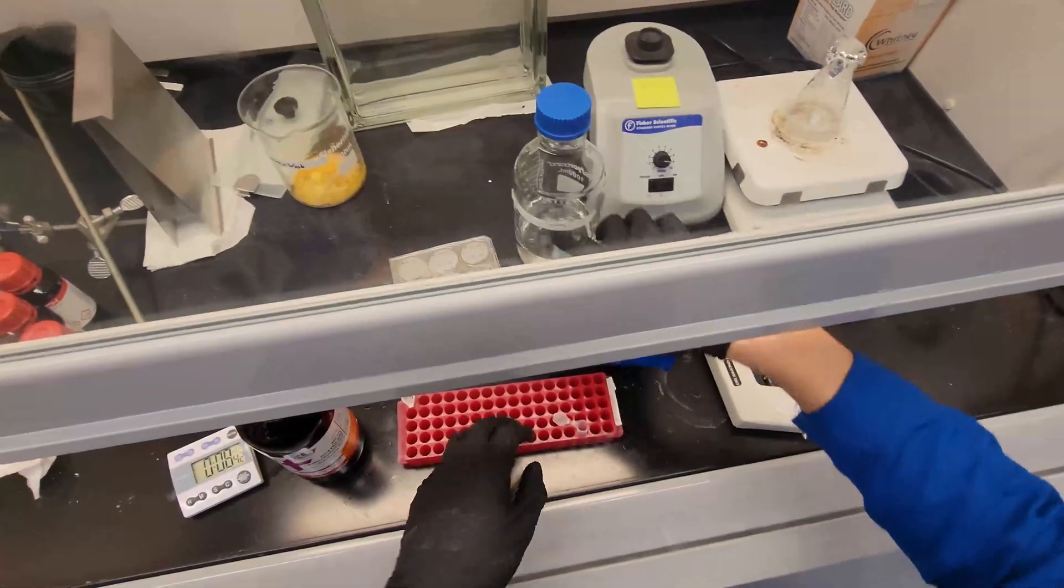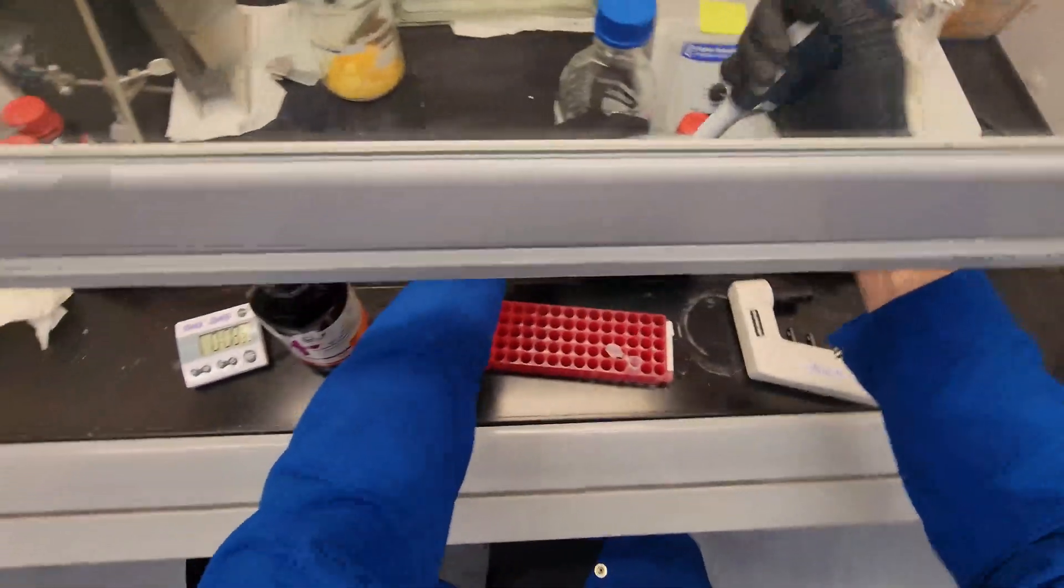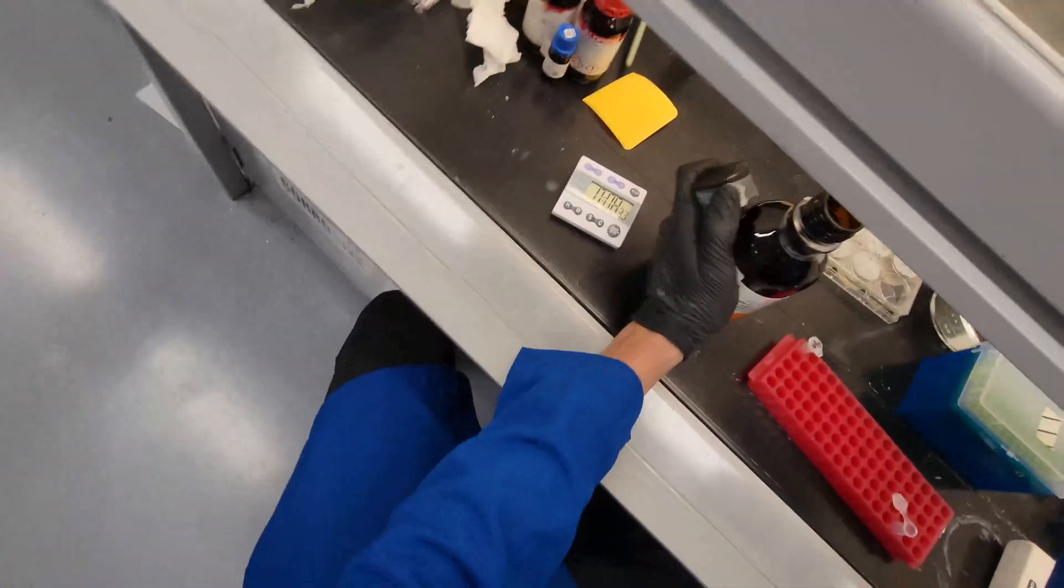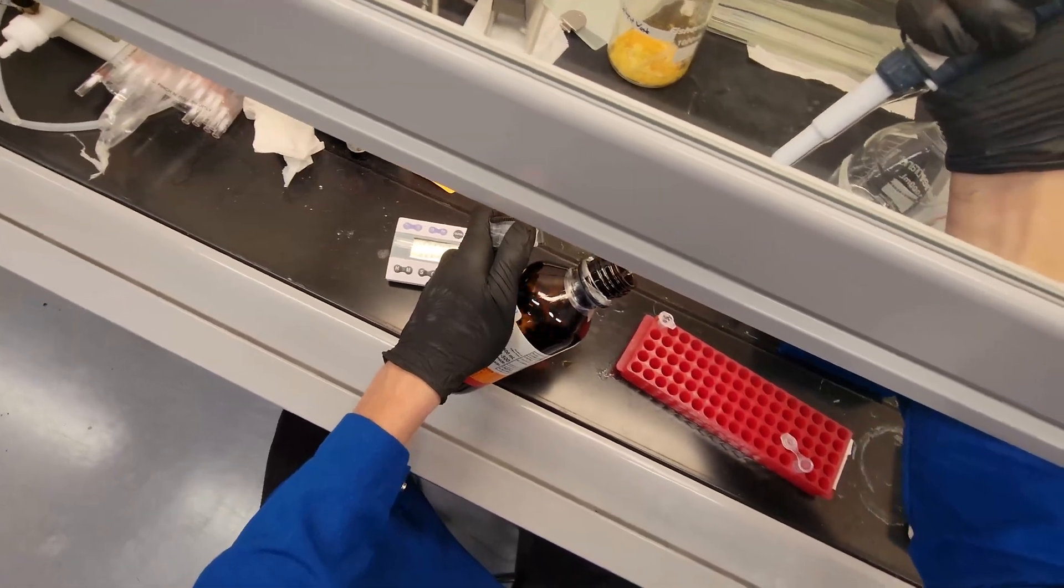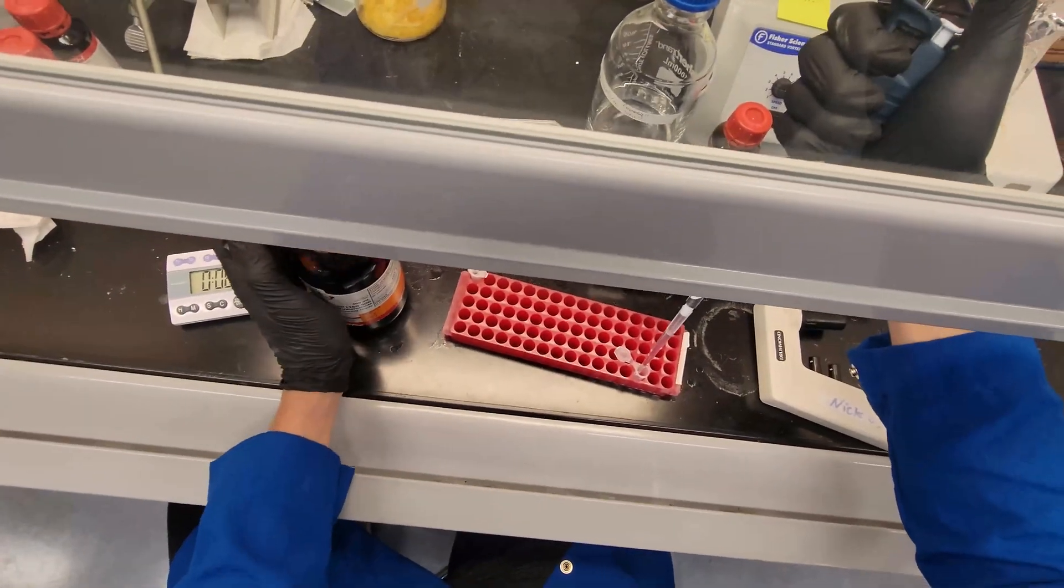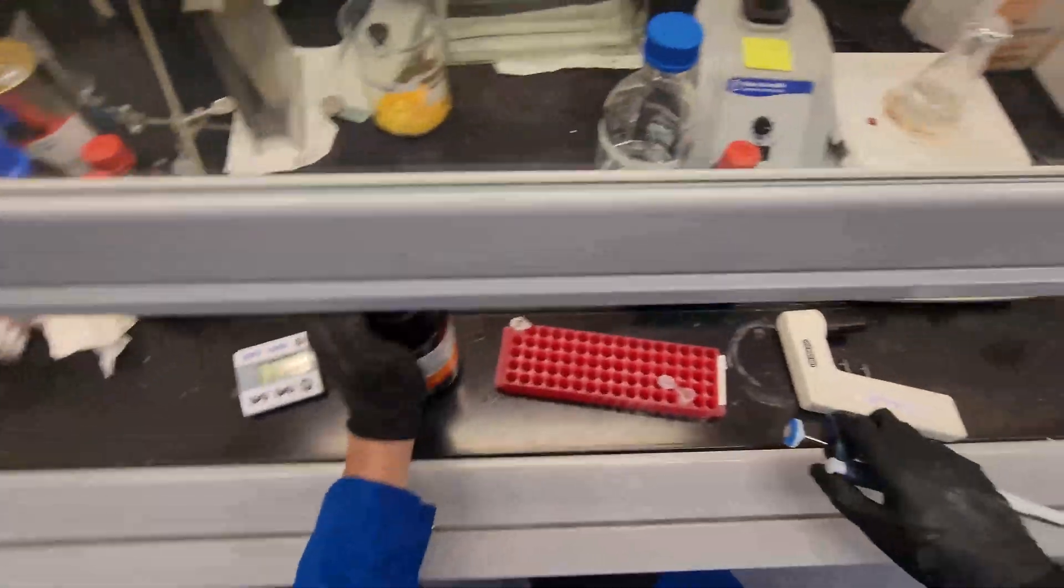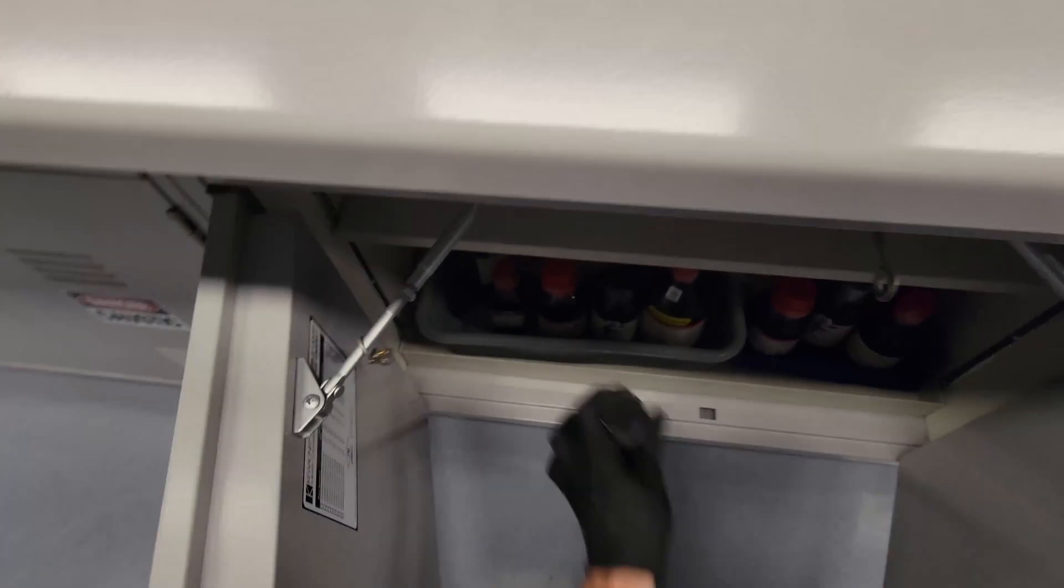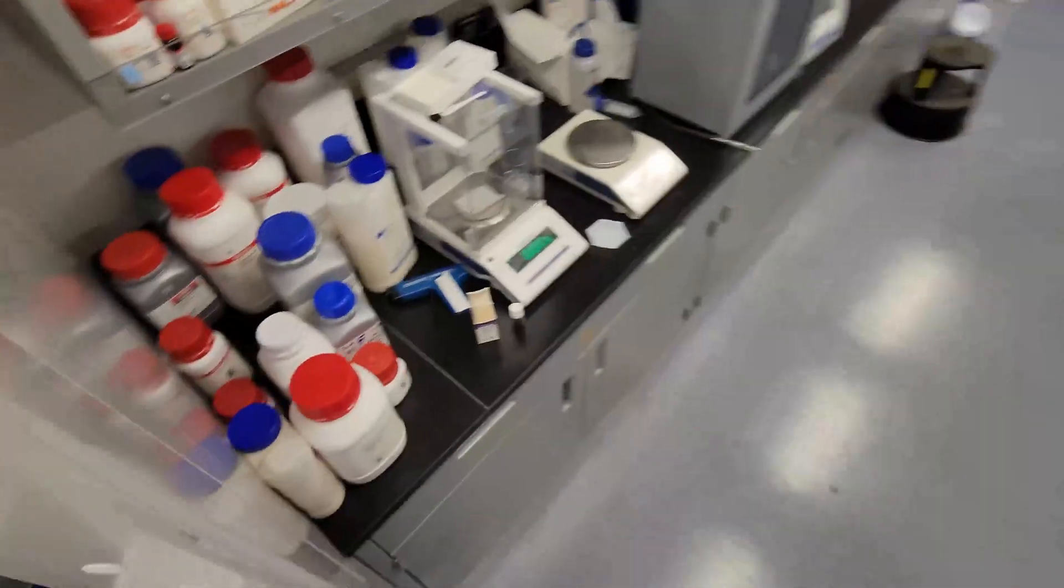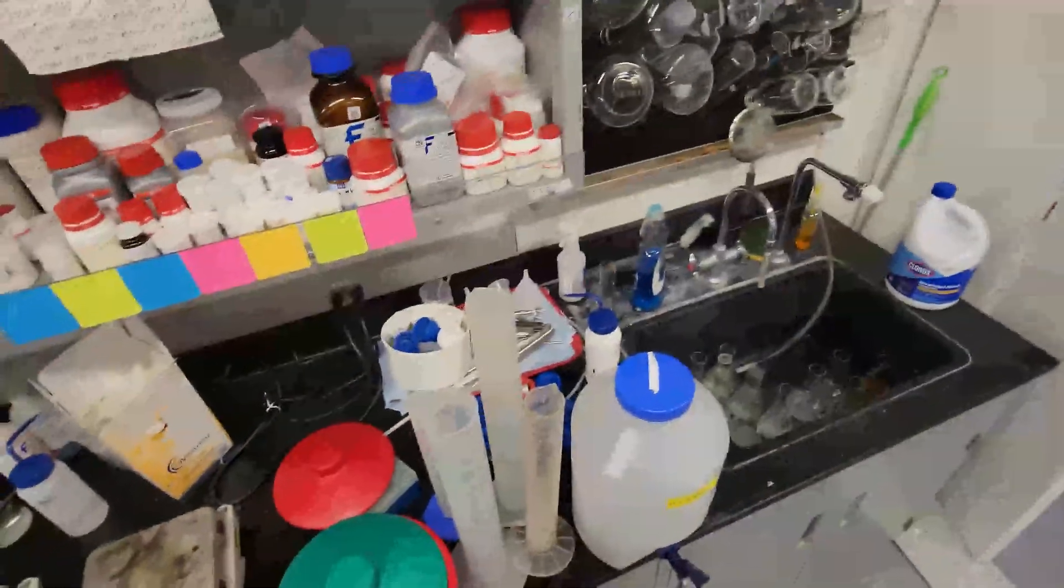X-Gal also decomposes in light. So we're going to want to wrap this tube in foil. If you can't see anything, I can't see anything either. All right. One mil. Going to open the NN-dimethylformamide. We got eight minutes on the timer. Shouldn't have taken the X-Gal out so early, but whatever. That cabinet always smells so good. We have some terpenes in there, like pinene and stuff. It smells really good.